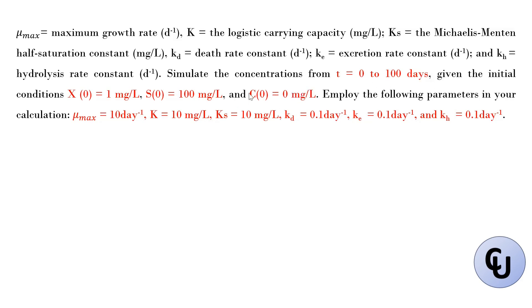Using this information, you have the initial conditions and you have the parameters. Let's see how we can solve this in GPROMS.